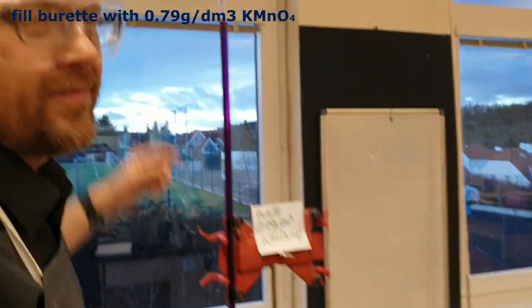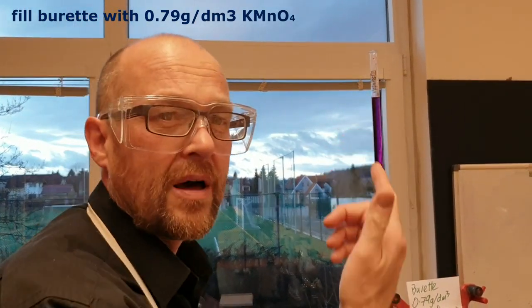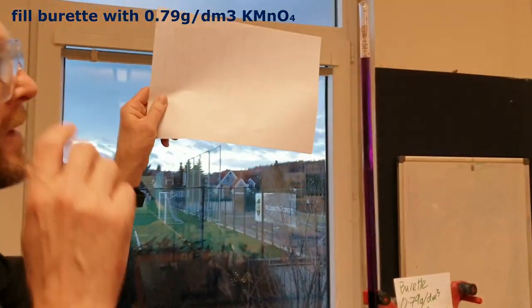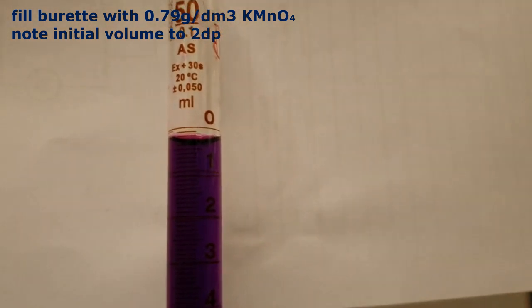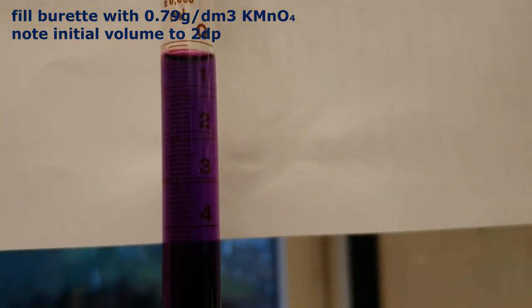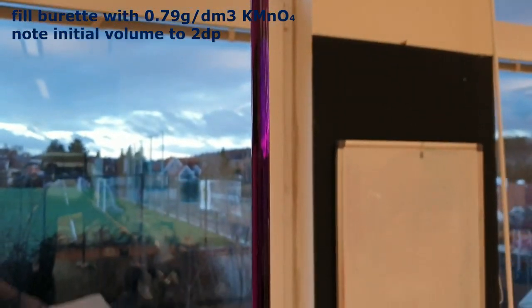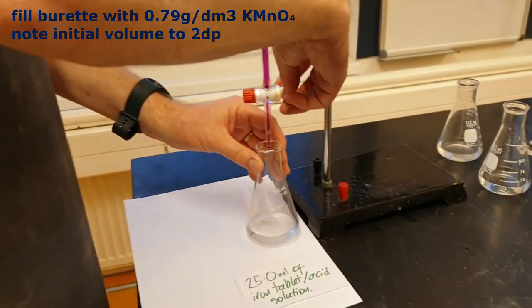Now, set this on zero. No, no, no. No professional sets it on zero. You just write down the number that it's at. Can you see? So that looks like 0.30. You can pause. Okay, the first titration is the rough one. So I'm just going to let it run.